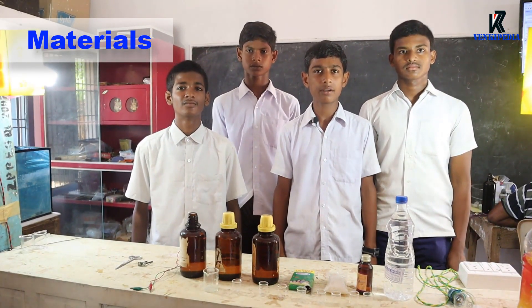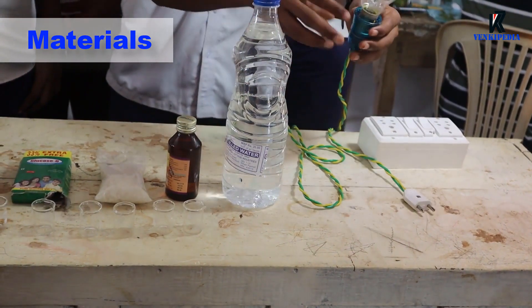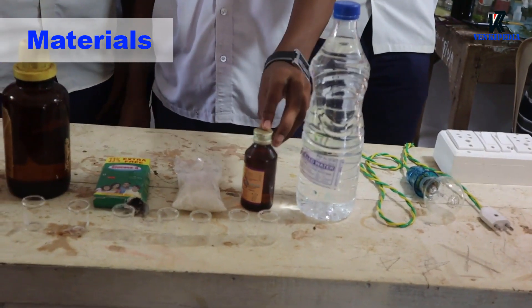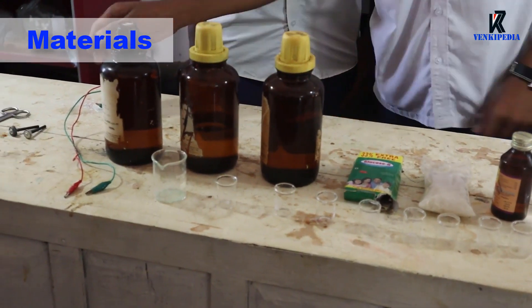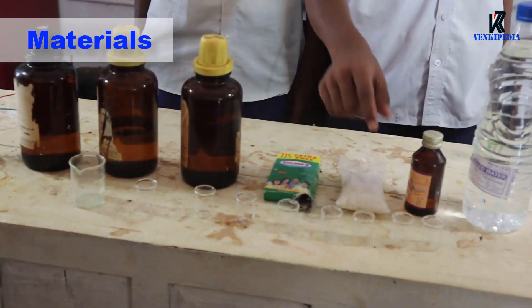Materials required: AC power supply, plug, holder, bulb, electrical wire, distilled water, ethyl alcohol, sugar, glucose, sulfuric acid, HCl, nitric acid, 2 alligator clips, 2 graphite rods, scissors, and beakers.